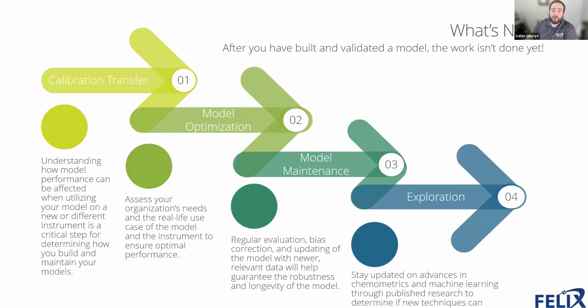And so what's next after you've built and validated? Well, unfortunately, the work isn't completely over. You still have some things to think about. The first thing we're going to talk about today is calibration transfer.